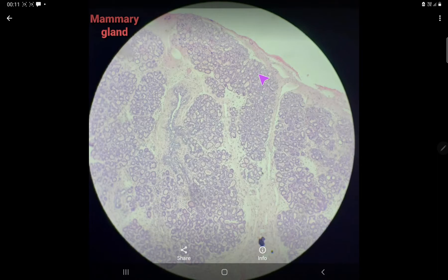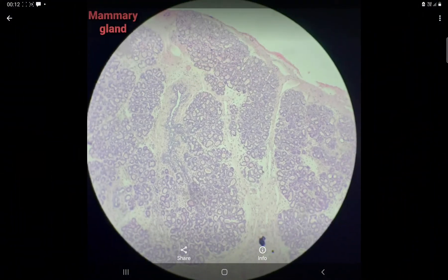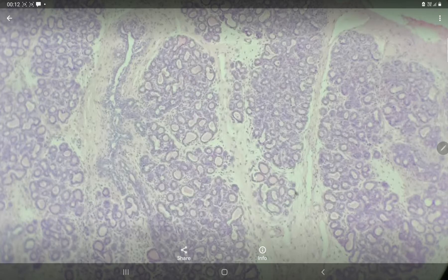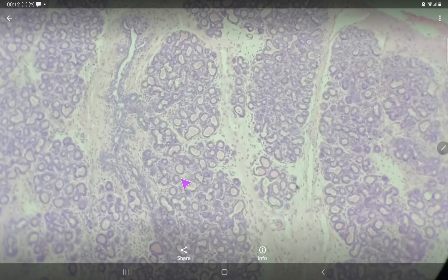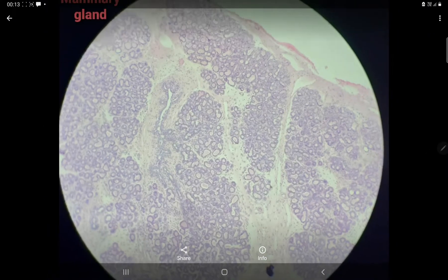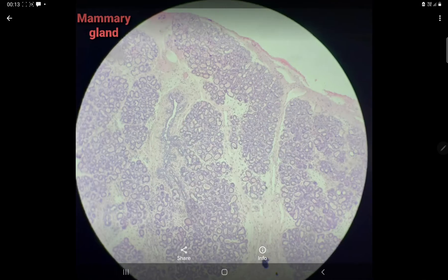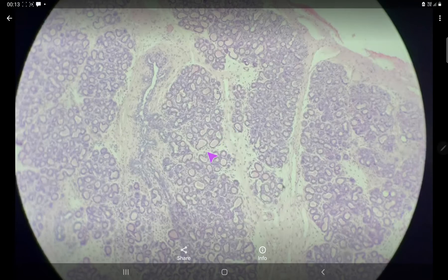In the mammary gland, you can find three types of slides. In one type, the connective tissue is more and the glandular part is less, and you cannot differentiate between alveoli and ducts — that is the inactive mammary gland. In the second type, you will find more glandular tissue and less connective tissue, but there is no secretion inside the alveoli or acini. You will find well-developed ducts, alveoli, lobes, and lobules — that slide belongs to the mammary gland of pregnancy, but there is no secretion.